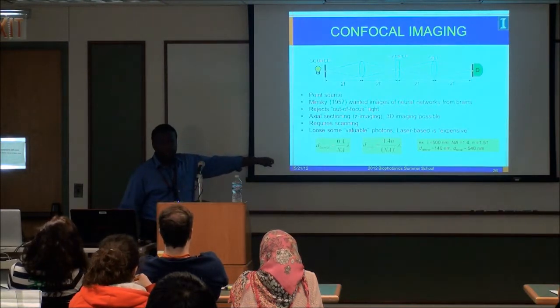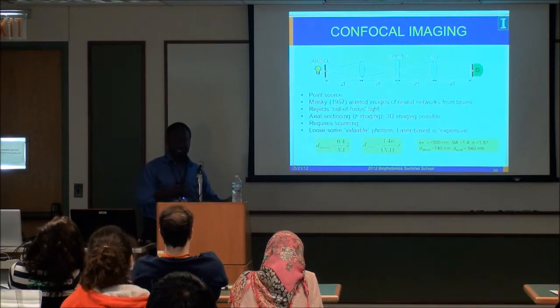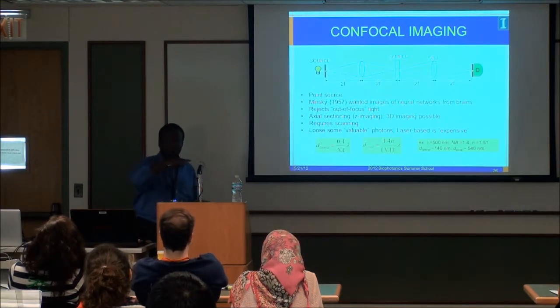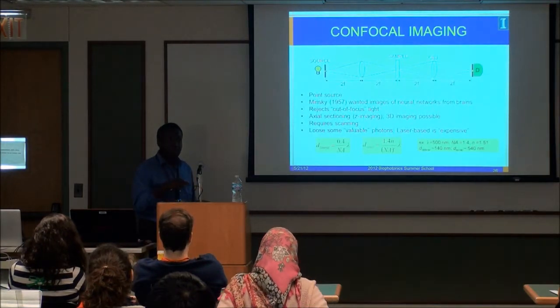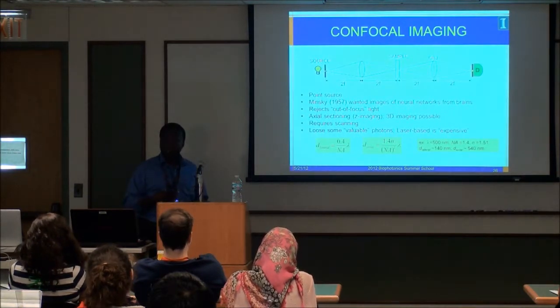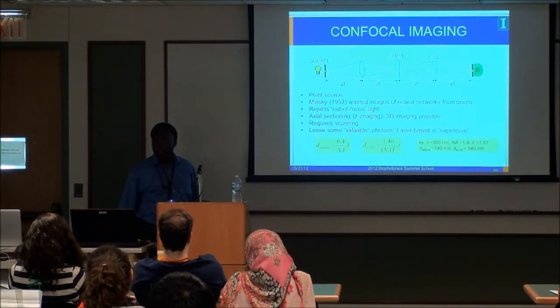computation, personal computers, the things that we take for granted nowadays, didn't exist in the way they exist today. This was also before the invention of the laser. To take each point and then form an image required a lot of processing, and that's something you couldn't do at the time. So this technology couldn't take off, and it really didn't take off until the mid to late 80s.